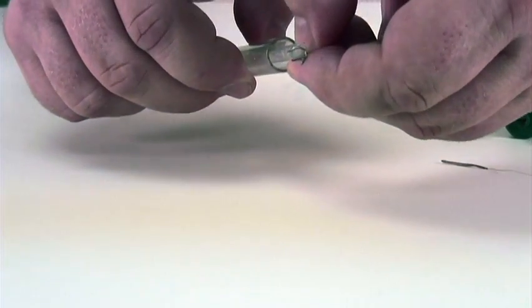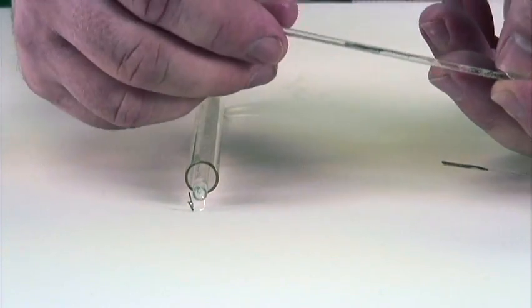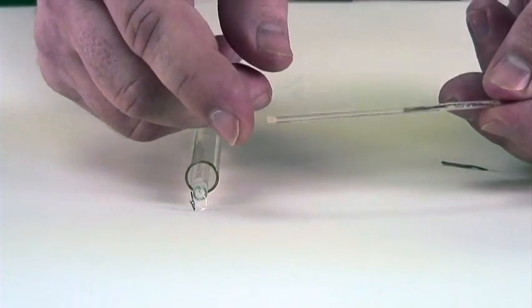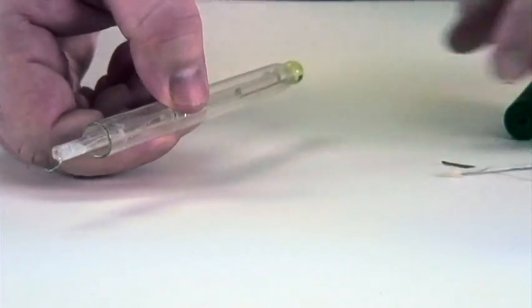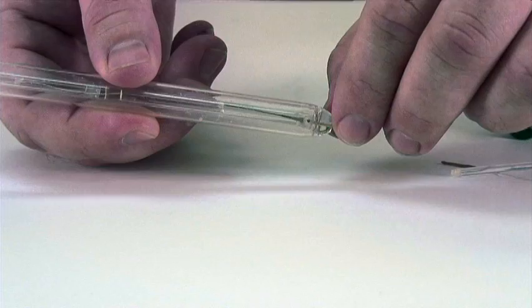So in order for the reference wire to make contact with the solution it has to pass through this inner junction as well as passing through this outer reference junction.